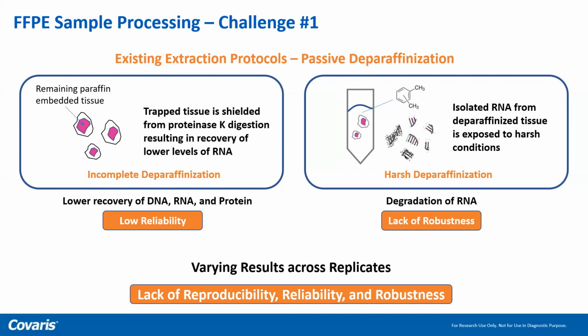Typically, what people do is they use something called xylene, or there are mineral oil-based kits and reagents available. So you start washing it. And over a period of time, it's like when you have a stain on your shirt and you're washing it until that stain goes away. But with so many washes, the shirt is also faded and frayed. So that also affects the tissues. With all those organic chemicals, it's also going to affect the tissue. And with that, it affects your analytes.